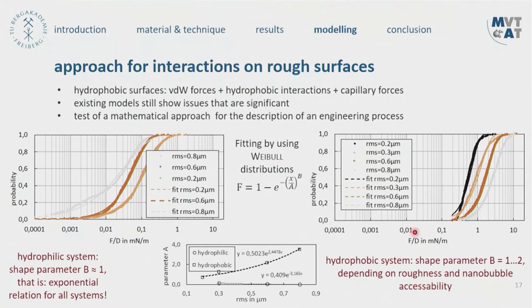Okay, we have the AFM providing a lot of data. The models are not sufficiently precise to describe the problem. Okay, let us take a holistic and perhaps a data-based approach. Why not simply fit the distribution? Being an engineer, I'm allowed to do so. The force distributions we have measured can be fit by a Weibull distribution, plotted here with its mathematical form.